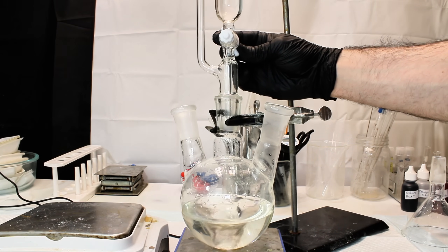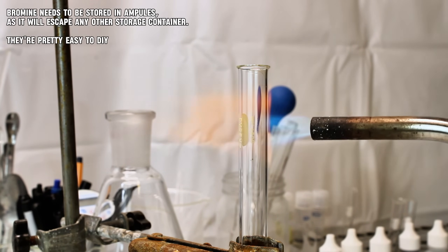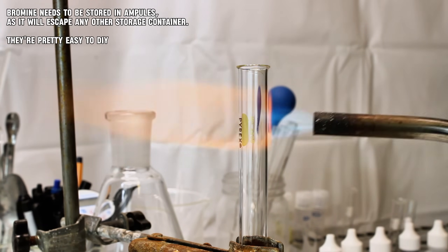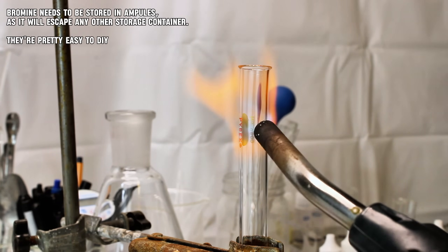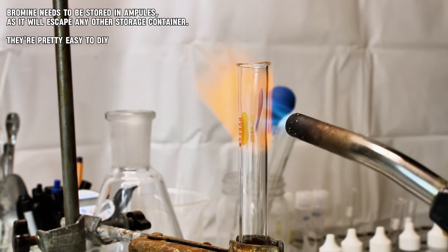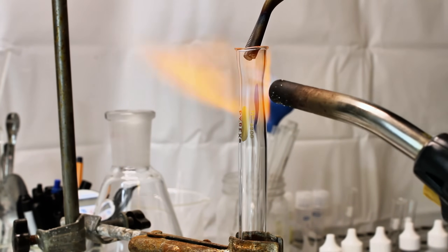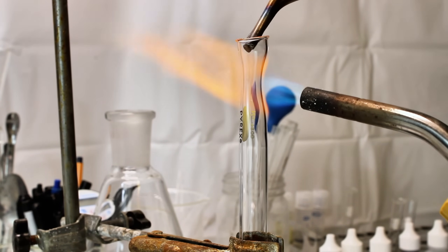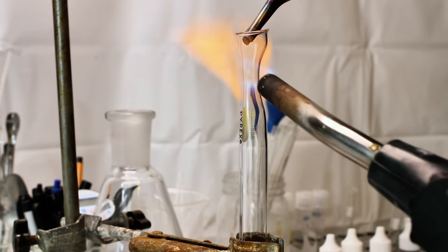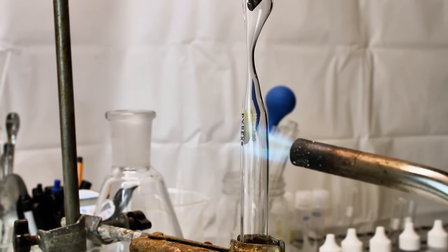In the meantime, I used this little intermission to make a few ampoules. This is simply done by taking a small test tube, blasting it with a propane torch, and then pulling out the neck as long as possible while still leaving an opening. This tiny reduced neck can later be easily melted with the torch, and then the neck pulled out completely to create a sealed ampoule. Doing this is highly recommended for storing bromine long-term, as bromine is extremely volatile and will slowly evaporate out of any other container it's stored in.